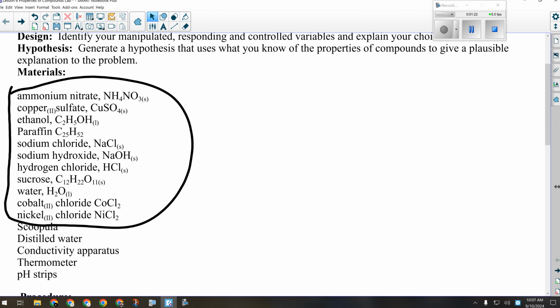So think in your mind about what some of the properties of these things might be even before we get started. We know that certain metals make certain colors. If we see those colors, it can really help us do some identifying. Out of this group, there's probably 4 you'll get right off the bat. You'll know which one they are right off the bat. And then the rest you're going to have to work out kind of slowly.